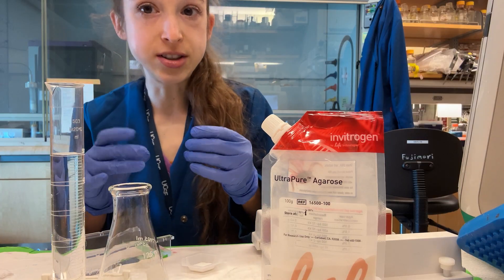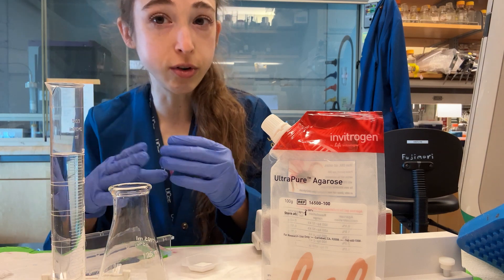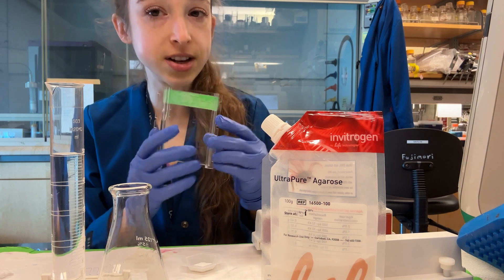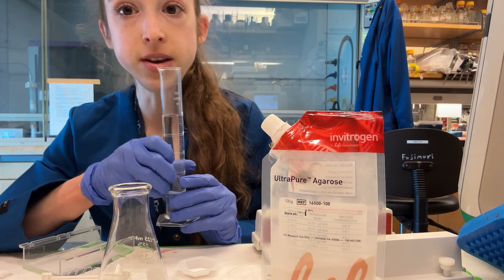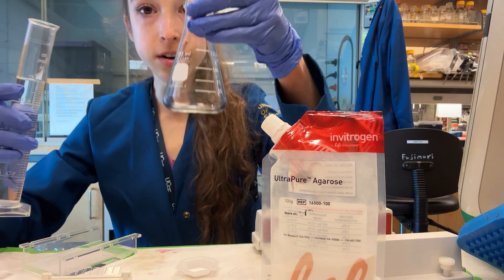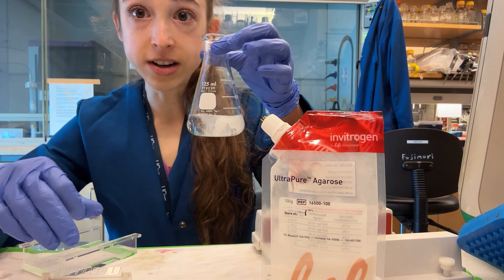You want to choose a percentage ideal for the fragment size you're looking for. 1% is typically common — that's one gram per 100 mils. If you're doing one of the big gels, 100 mils will do, but for these little gels you only need 50. So if I want a 1% gel, I can weigh out 0.5 grams of agarose and dissolve it in 50 mils of buffer. I'm using a TAE buffer. We also need an Erlenmeyer flask — just pour in your buffer and then pour in your agarose.